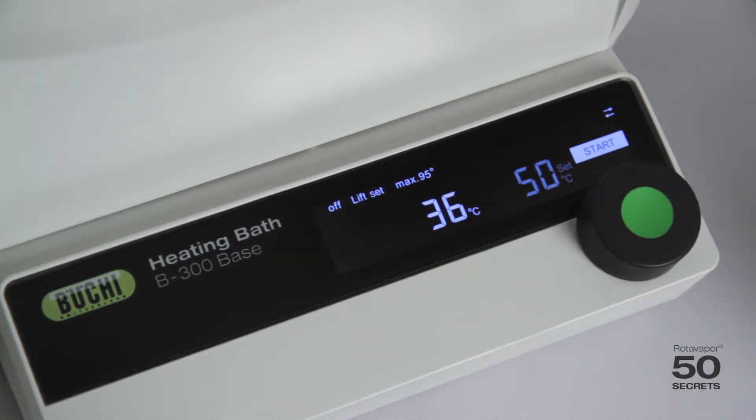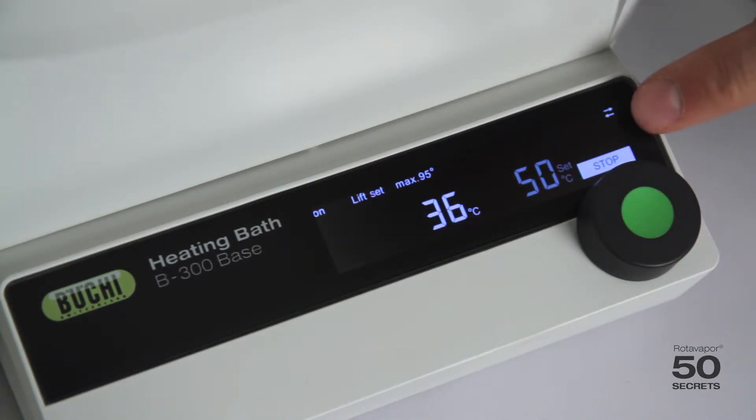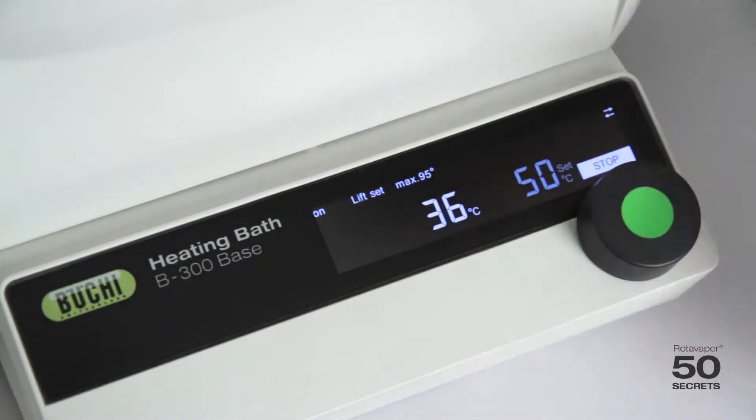The most important function, if you want to start the heating, is to simply press this button. You can see it turns from start to stop, and it shows that it's on.